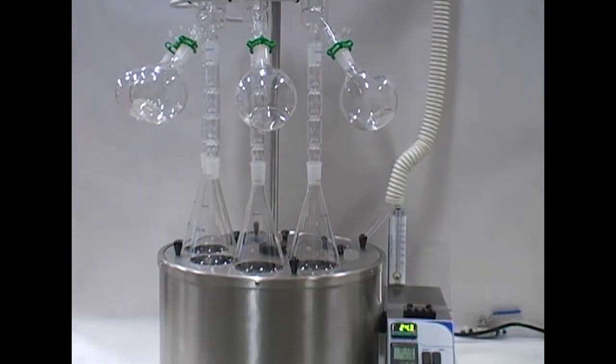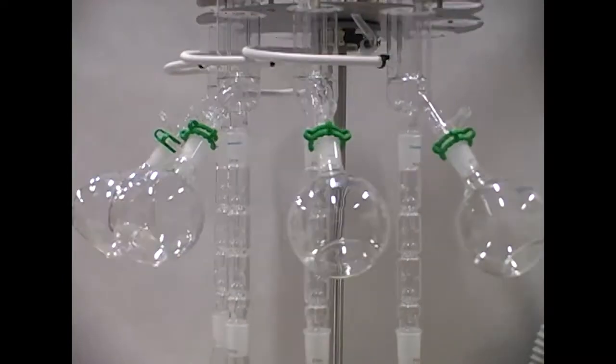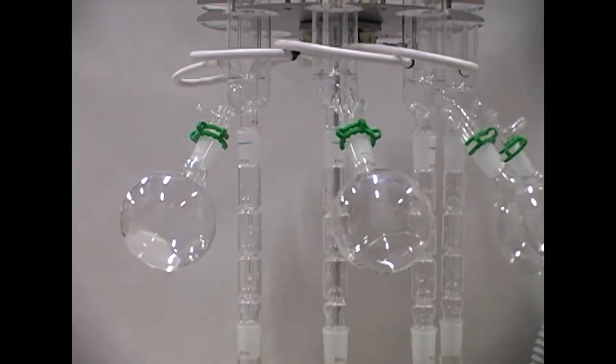Organimation's line of S-EVAP solvent evaporators provide reliable parallel evaporation of large-volume samples in both an affordable and environmentally friendly package.